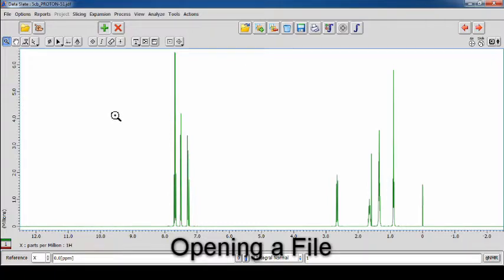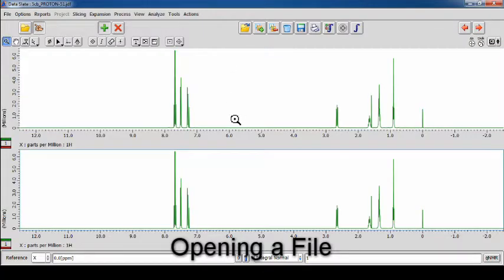The second method is the use of the Finger Geometry tool. This method requires a geometry instance to already be open on either the same dataslate or a different dataslate. First, ensure the Open Data by Fingering Geometry button is toggled on. Then click Open Data File. This will turn the cursor into a finger icon. To open a new geometry instance, hover the cursor over an already open geometry instance and left-click. This will open the selected geometry instance onto the dataslate.